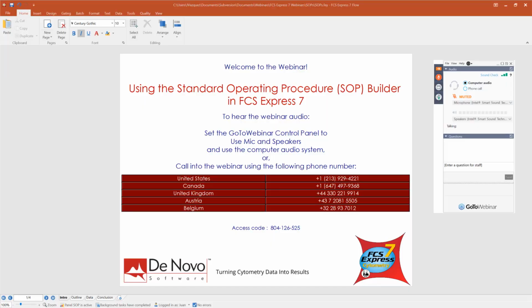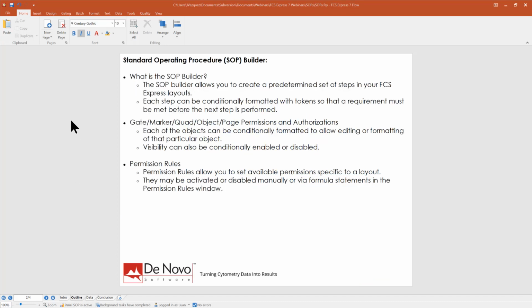Okay, so thank you for joining me on today's webinar using the Standard Operating Procedure Builder in FCS Express 7. Today's webinar is going to focus on how you can use the SOP Builder to allow you to create predetermined steps or instructions in your FCS Express layout.